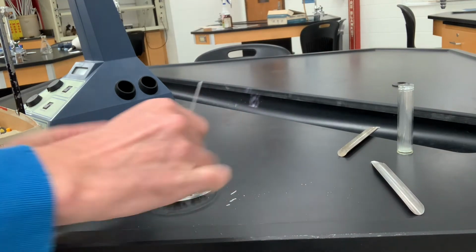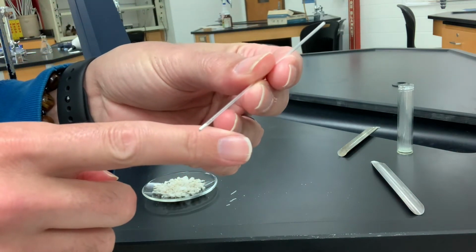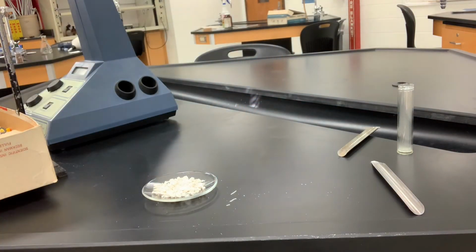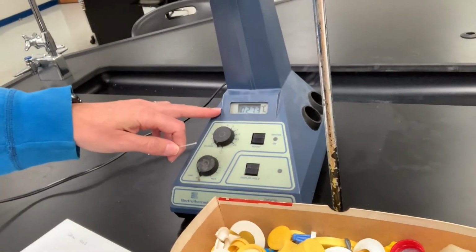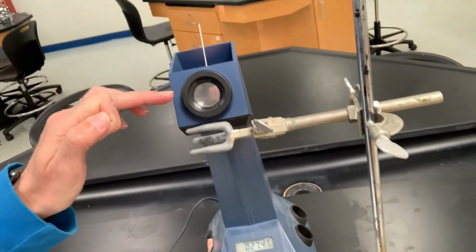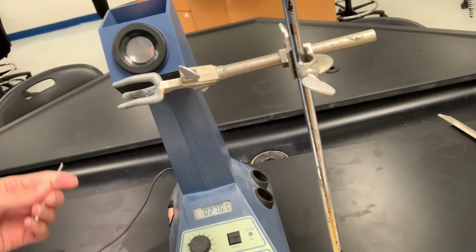Okay, I've got more than I need there, about 4 millimeters. But let's go ahead and do that. So I've got my melting point apparatus here. Once again, I'll have one camera pointing at the temperature reading here, and the other camera pointing down the viewpoint here where my microcapillary is placed into an aluminum block that's heated.